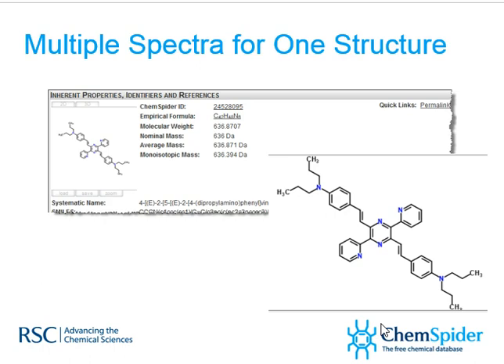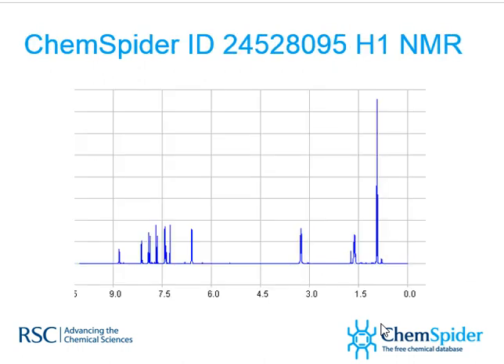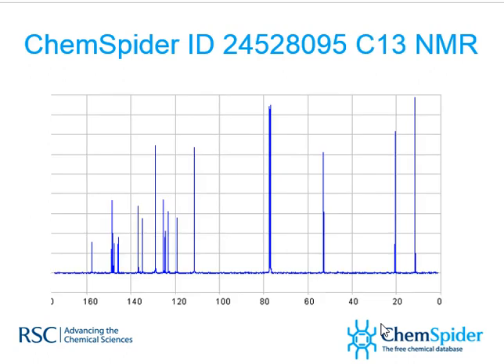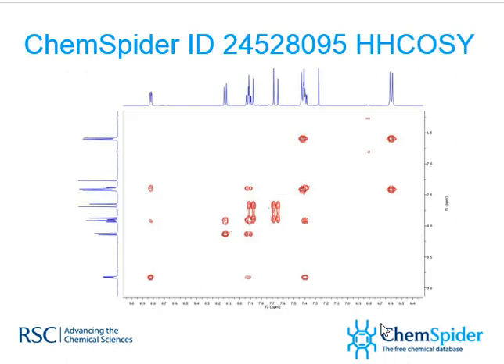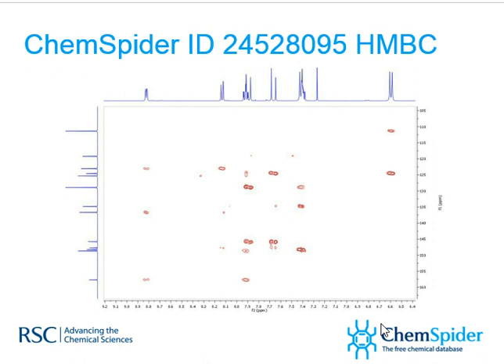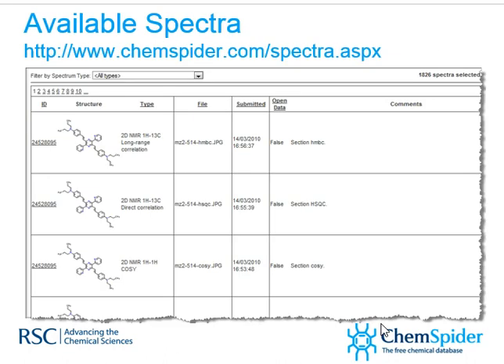For this particular structure, the scientist actually acquired a pile of relevant data and deposited it. This is from a gentleman in Germany who used to run an NMR spectroscopy lab. He's put on the proton spectrum, carbon spectrum — these are fully zoomable and you can interact with the data. He also deposited images: the COSY, the HSQC, and the HMBC. So it's a very rich data set for people to work with, certainly for students to practice and get trained. To see all available spectra, you just go to chemspider.com and look at spectra.aspx.